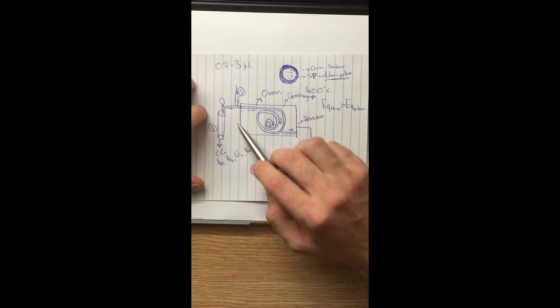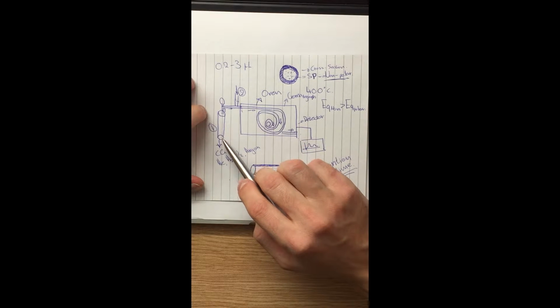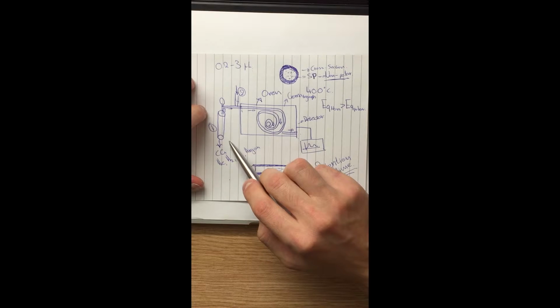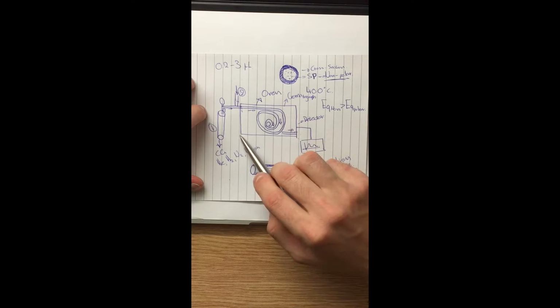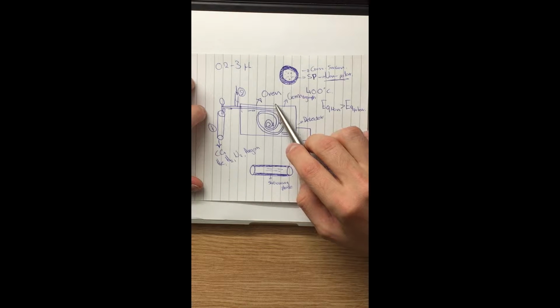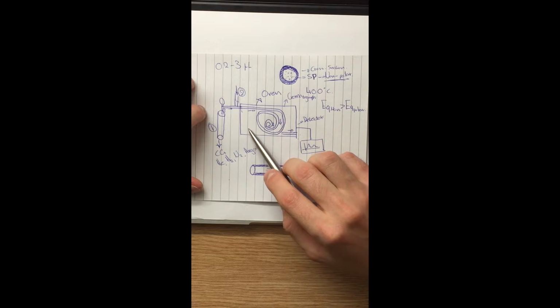The first main component is a carrier gas. Carrier gas can either be helium, hydrogen, nitrogen, or argon. These 4 gases are really stable and non-reactive, so they don't react with a stationary phase. I also want to mention that carrier gases are the mobile phase in this case.